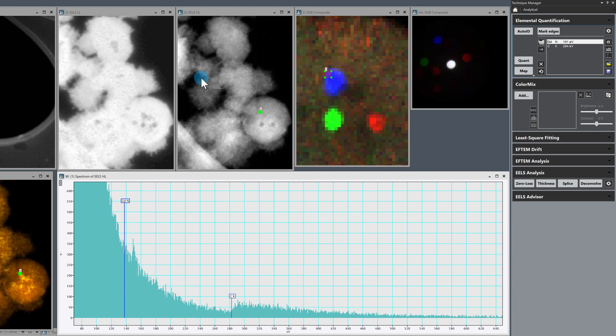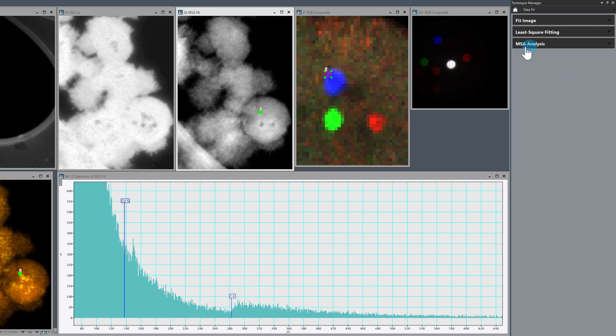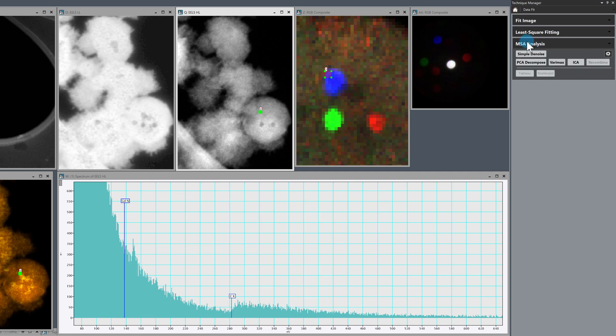So one of the nice things that we can do is we can use the multivariate statistical analysis tool to do principal component analysis, or just a simple denoise. So yeah, this is kind of the last piece of the puzzle. So we select the EELS high loss dataset, and we press simple denoise.